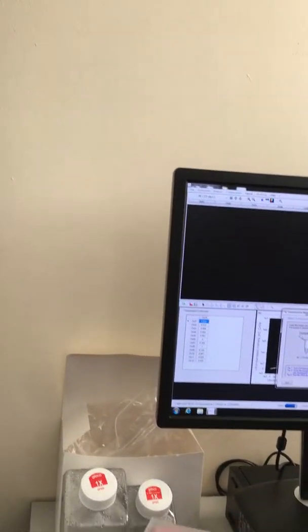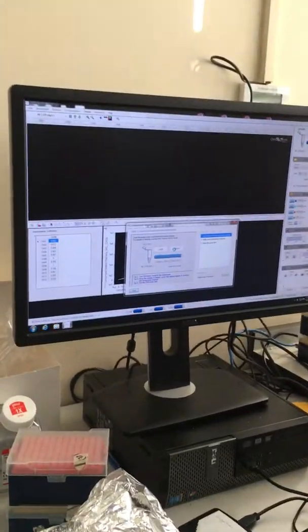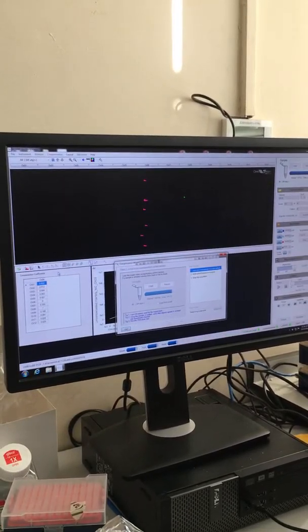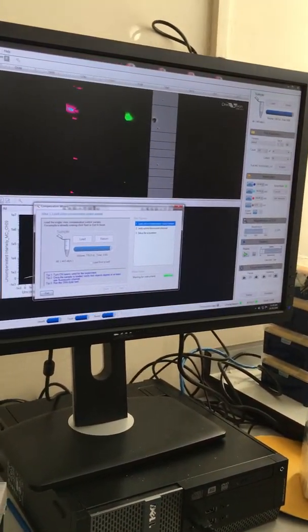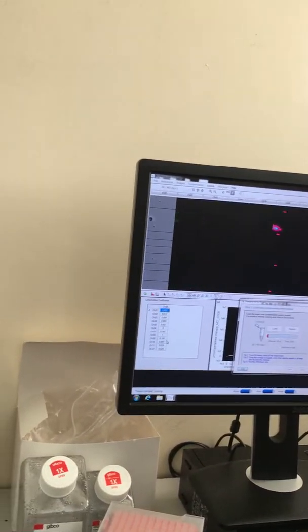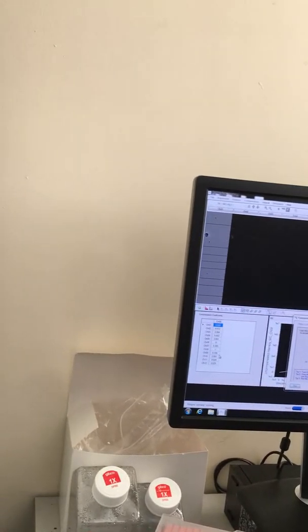Press next and it will return your sample for you. Oh no, my bad, sorry. Go back, return, and now it'll return your sample. So then the compensation here, these are your compensation values. It's saying there's a big spillover into channel 7 of about 35%, and channel 9 as well of 18%. Press OK on the screen now.